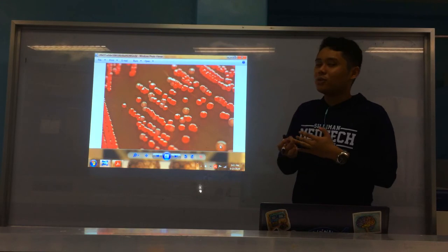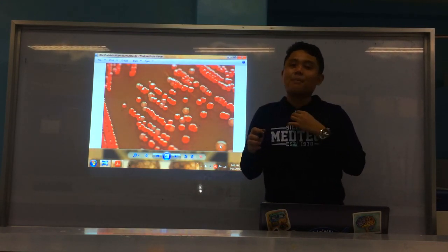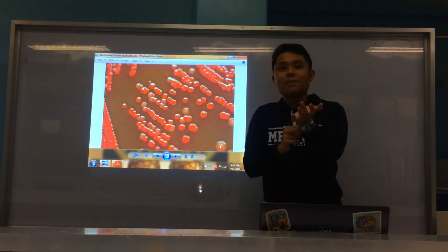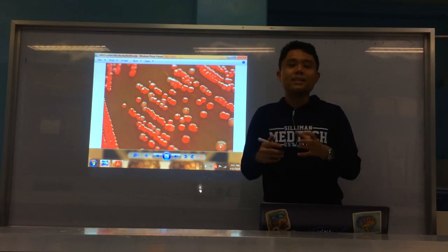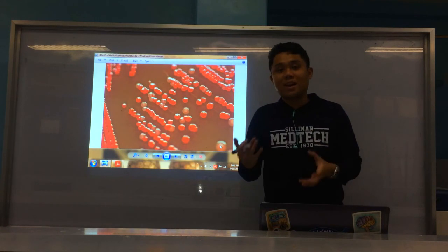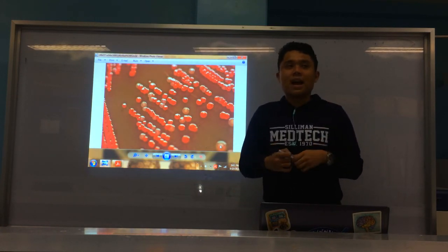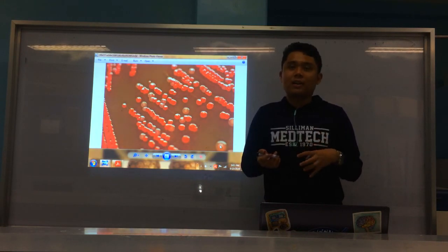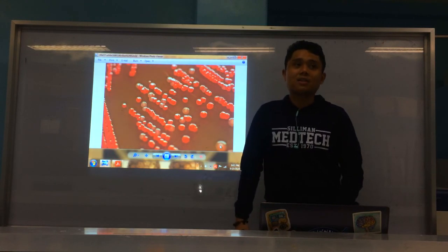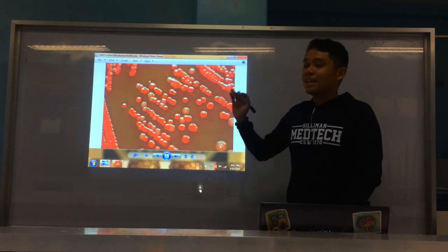Alright. So, basically, those are just some examples of colonies. Again, I just like to highlight na po na colonial morphology or ilahang characteristic colony appearances do not replace other tests na atong gina-perform for their definite identification. As mentioned sa start palang daan, colonial morphology only serves as a presumptive identification tool, or it can also help, okay, to further solidify our assumption on what is the probable identity of the organism. Okay, so yeah, that's it for colonial morphology.